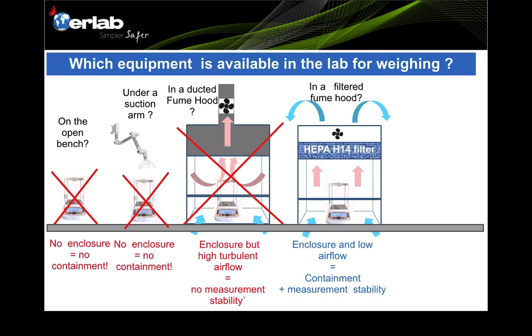Then comes the filtered fume hood, which is the preferred way. Why? Because it provides enclosure, it has low airflow — typically 0.4 to 0.6 meters per second. It provides containment, and at the same time, because of the smooth airflow and less turbulence, it basically provides a stable environment for weighing applications. So this is the preferred method.